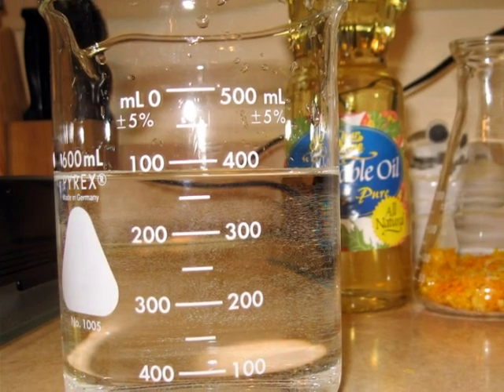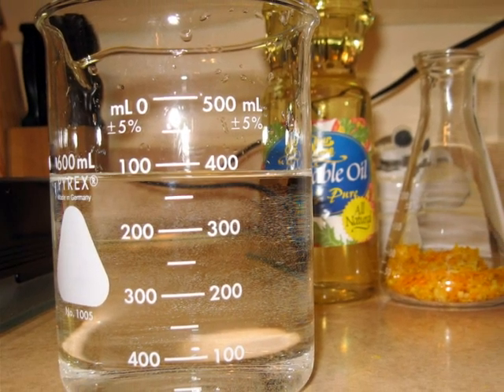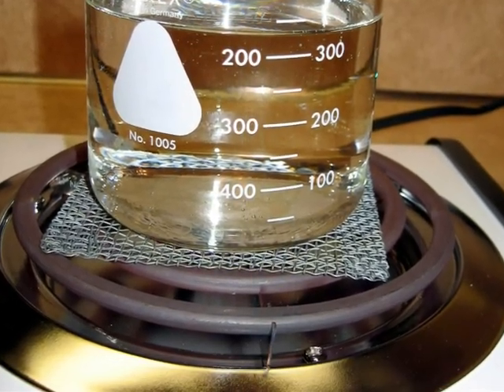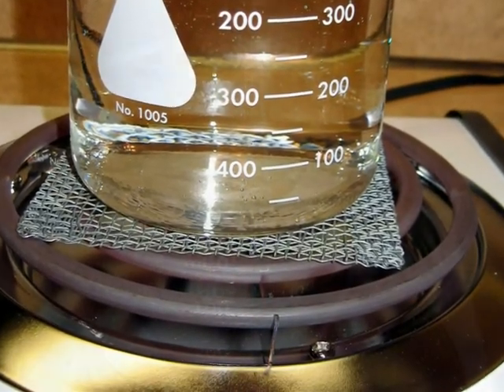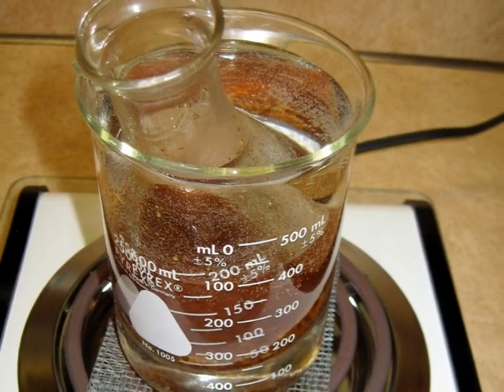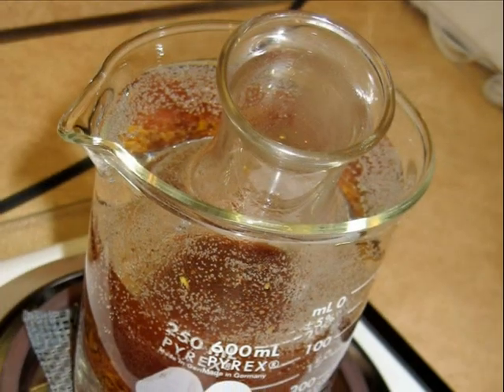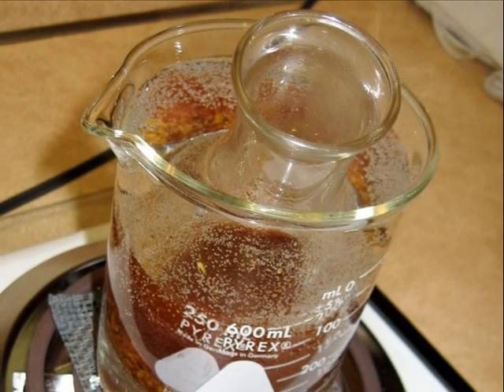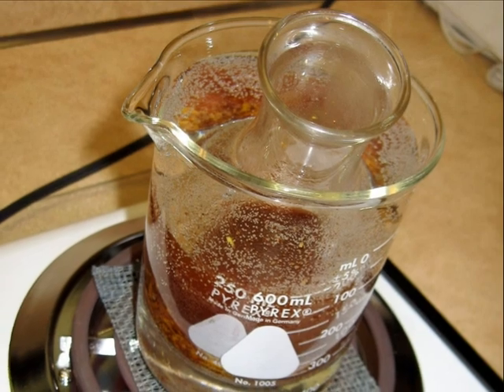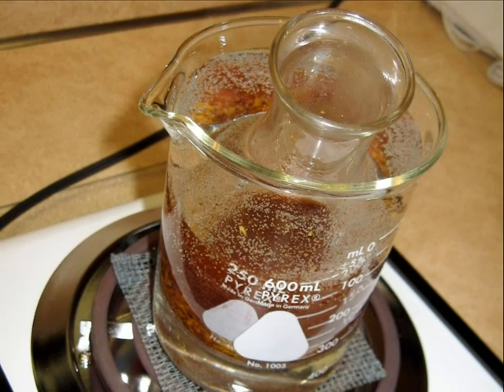Next, you will partially fill a beaker with water to create your water bath. Put your beaker on a hot plate or other heating element. Then insert your flask unstoppered. Adjust the position of the flask so that the vegetable oil mixture is completely submerged in the water, but make sure that no water gets into the flask.